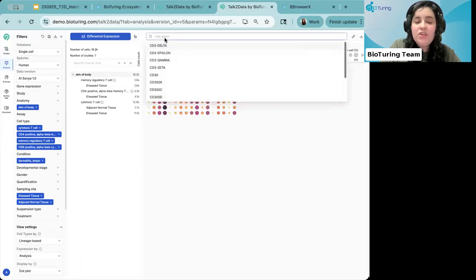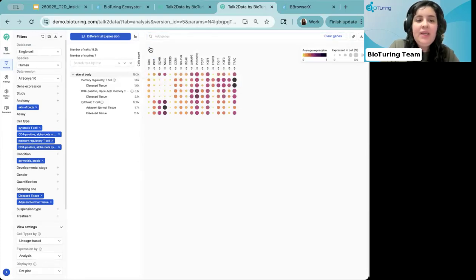You can add other genes as well within the system, especially if you're focusing on multiple targets or like the top 50 targets, and you want to identify any off-target effects across other immune cells. You can add these genes within the search as well. So now that we're within the system, we can actually look at a bubble heat map of this expression.